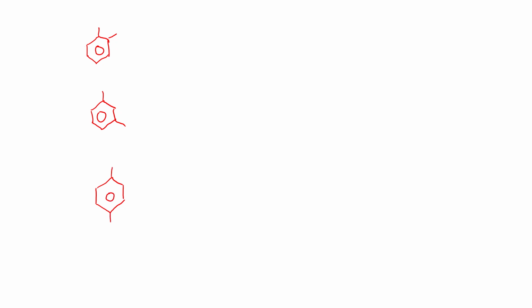So the key to that's going to be the fact that there are only 4 different carbon environments, so there is, as we said, some symmetry in the ring. Now how that's going to work is going to depend on knowing whether those 2 substituents are the same as one another or whether they're 2 different groups. And in our case, we know they must be different because there's only 1 oxygen in the molecular formula. So they can't both contain an oxygen, but one of them must, so they've got to be two different groups. So let's just label them X and Y to emphasize that they're different.